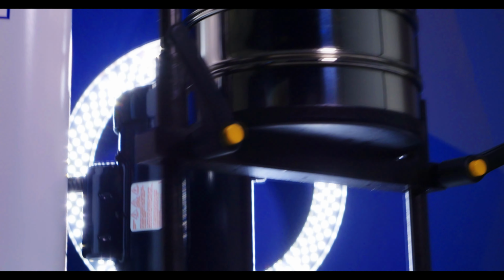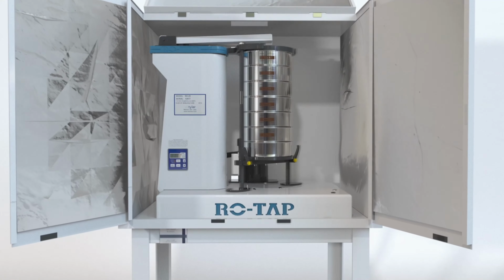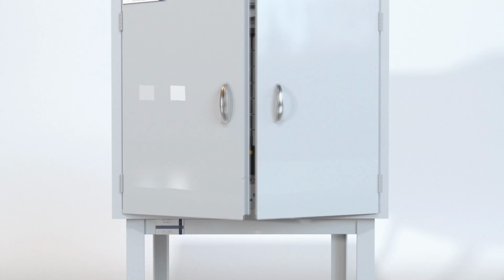The mechanical shakers typically have to be secured or bolted down because they can move around a lot. If they aren't bolted to a table or a workbench, they can literally walk themselves away. And since the machine runs at around 85 decibels, that means they can get pretty loud, which is why these shakers can also be placed in a special cabinet that greatly reduces the noise.